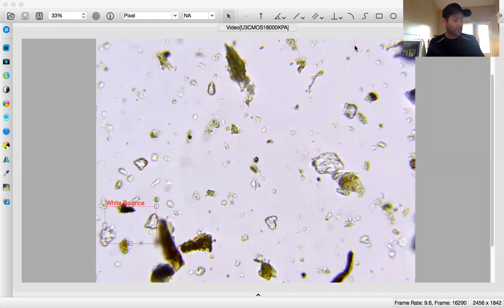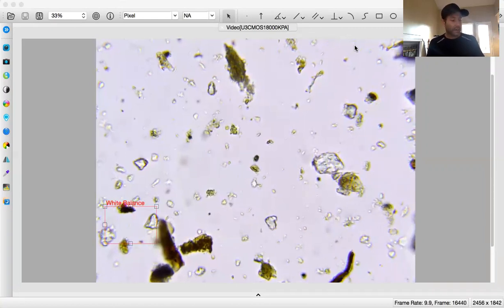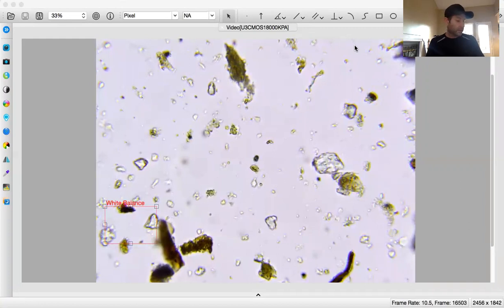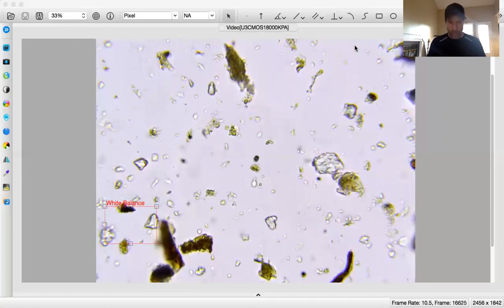I'm doing 5 readings. I'm going to narrate only the first 5 fields of view of the first reading area of the swimming lane approach. My dilution is a 1 to 5, and I'm doing compost. My field of view for my camera is 200 by 300 micrometers. I'm dialed in at my 400x objective, and I have an iris that's closed down, and that means I'm shadowing. So we're excited to have all these things just happening. And now we're going to begin.